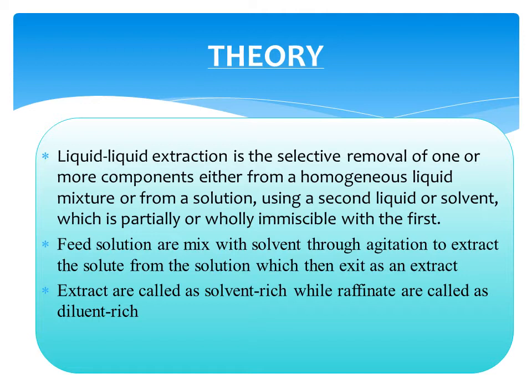Next is the theory of the experiment. Liquid extraction is the selective removal of one or more components either from a homogeneous liquid mixture or from a solution by using a second liquid or solvent which is partially or wholly immiscible with the first one. Feed solutions are mixed with solvent through agitation to extract the solute from the solution, which then exits as an extract.